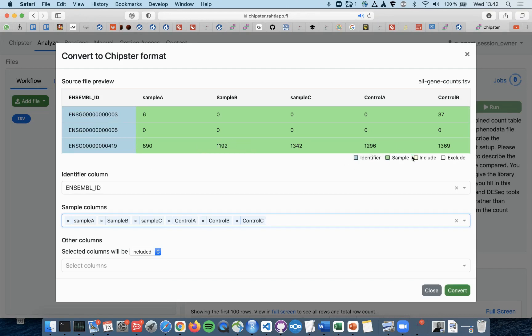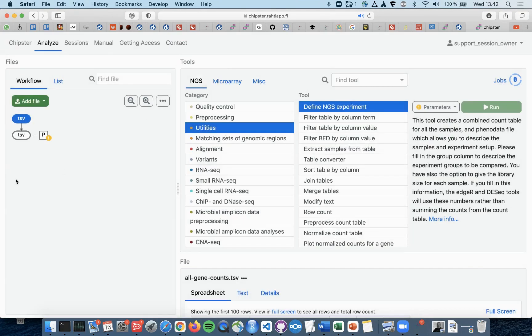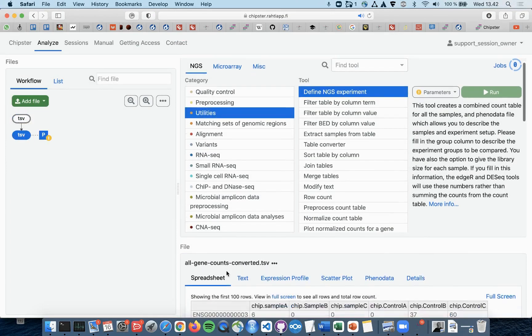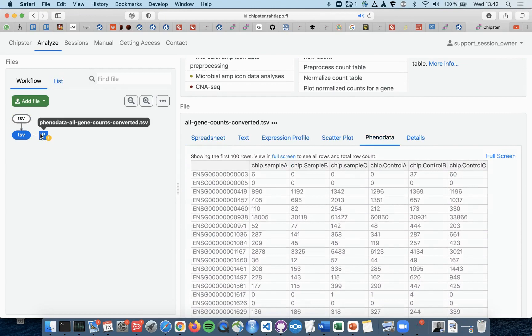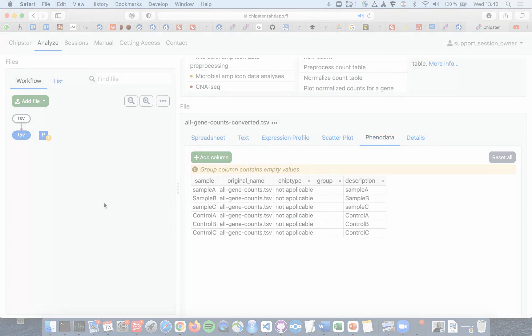Here you can see the summary of the situation. Now we can just click Convert and after a while a new TSV count table in Chipster format should appear together with the phenodata file.